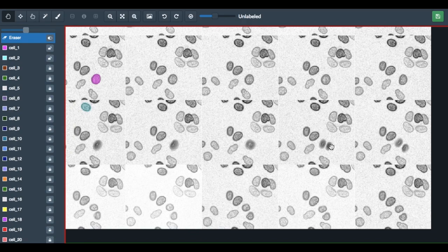One way that cells can appear or disappear is through cell division. Cell division looks like this. A cell will become slightly peanut-shaped and then will split into two separate cells. When the cell divides, the two daughter cells should be labeled using new colors, and the color of the parent cell should never be used again.